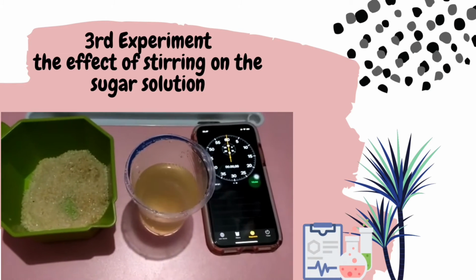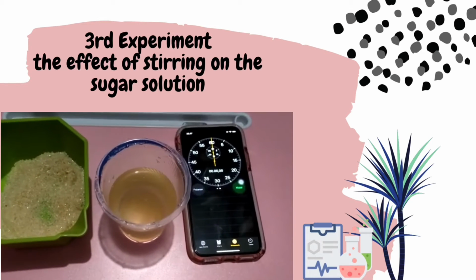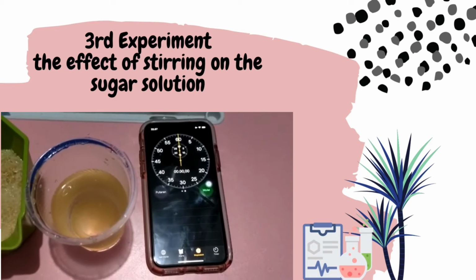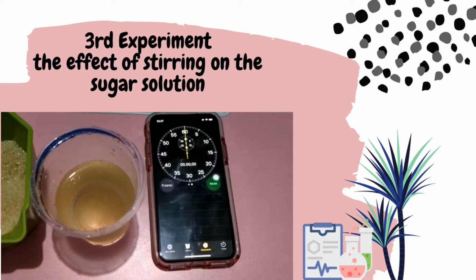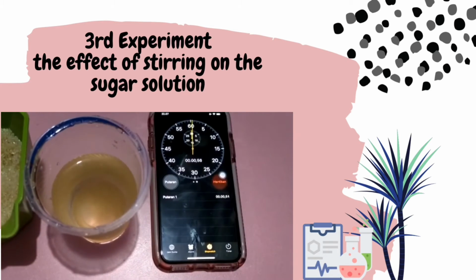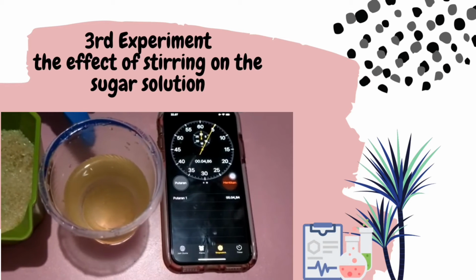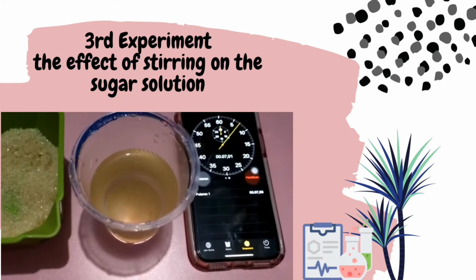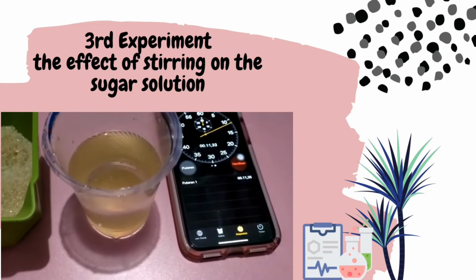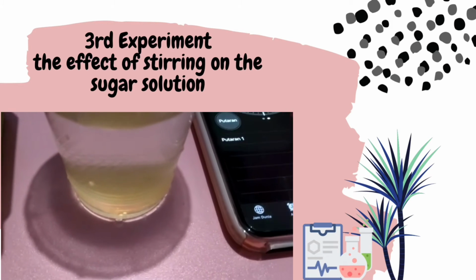Don't forget to prepare the stopwatch. This is the observation without stirring, and we can see what time the sugar will be dissolved.